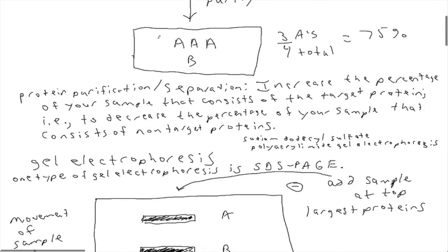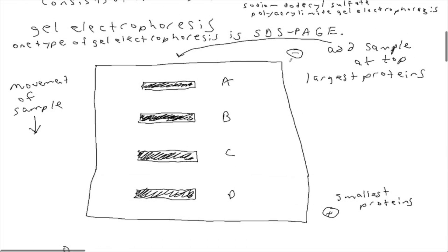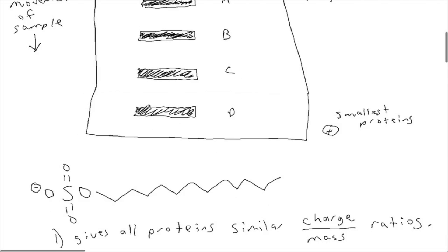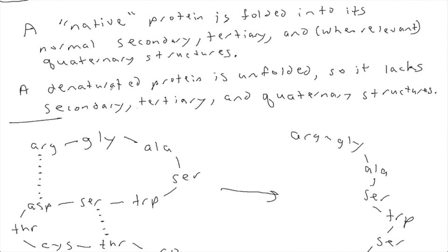So we talked here about SDS-PAGE. I think that before you might not have been quite clear about the role of the sodium dodecyl sulfate in giving all proteins the same charge, similar charge profiles. So that might come up on the test. We also talked about another kind of unrelated idea, or a little bit of a digression, but this is very important, understanding the difference between native and denatured proteins. Those are very important terms that we hadn't quite had time to talk about before, but I'm sure those will be important on the test.